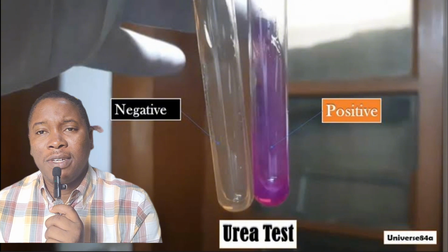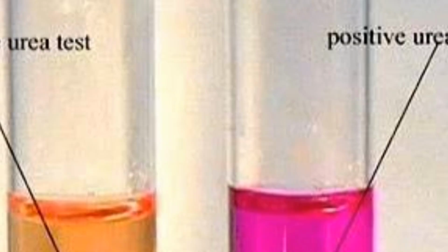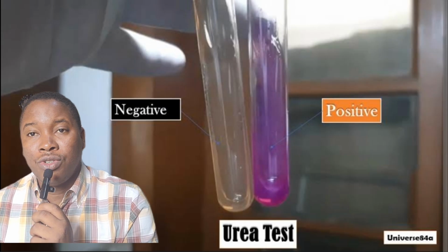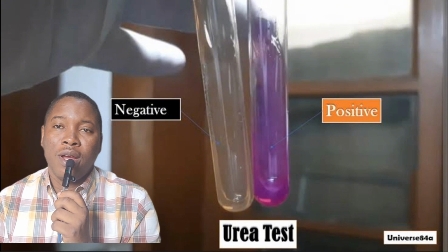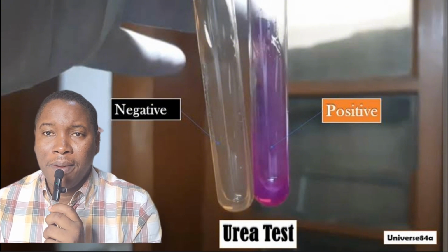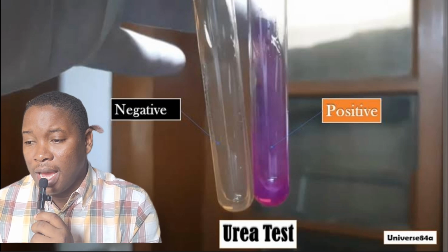There are different types of agars that can be used to run this urease test. There's Christensen's agar, which is the most common type of agar that is used. There's also Stuart's urea broth. These are two types of media that are used for the urease test, and they are quite simple and easy to do.